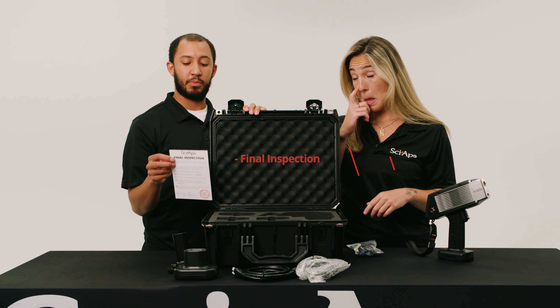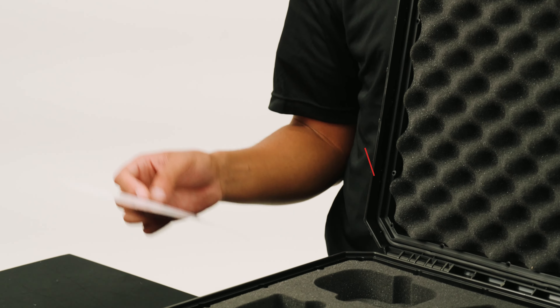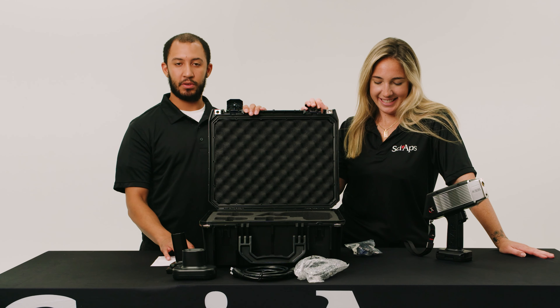You will also get a final inspection notice basically verifying that everything was inspected at the end before it left our building and arrived to you.